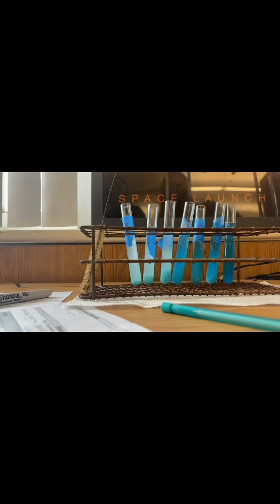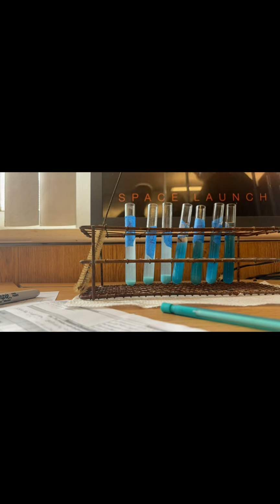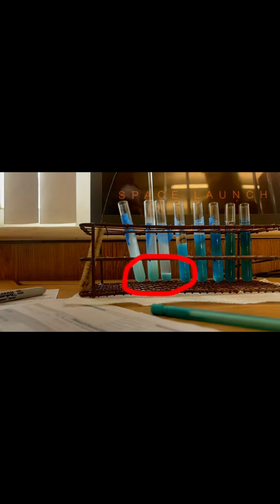We set each test tube in a rack and waited 15 minutes, stirring consistently with a stirring stick, to let the precipitate settle. After the precipitate settled, we were able to see its form, observing its light blue opaque color, moving easily if it moved in the test tube. We also observed that test tubes 5 through 8 started to change color to a darker green compared to the other precipitates in test tubes 4 through 1, which stayed the same vibrant blue.